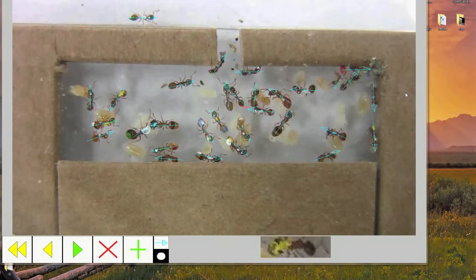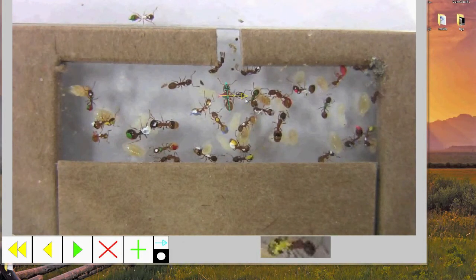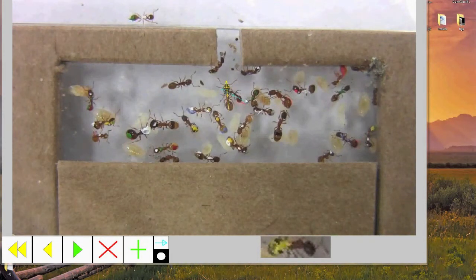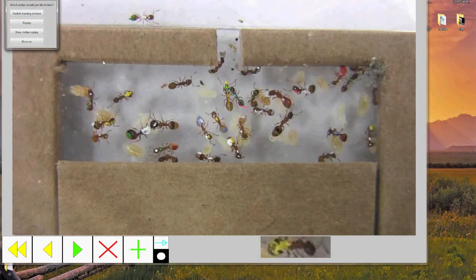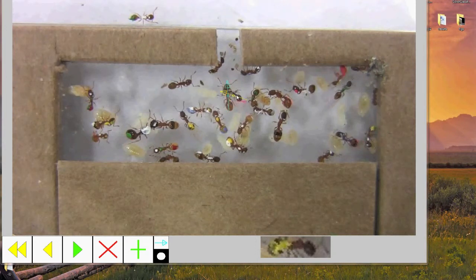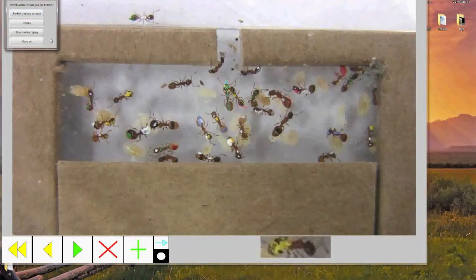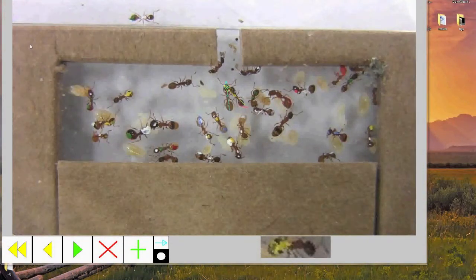Sometimes the automated tracking will stop and a pop-up window will appear asking you to validate the tracking results. When this happens, press OK and then watch the replay. Your job is to see whether the tracking arrows switch at all during the replay or whether they stay on the same ant the entire time. As you can see in this first replay, the tracking arrows do indeed switch, so when the next pop-up window appears, I will choose the option to switch the trackings. I then replay to confirm my results. As you can see now, the yellow arrow stays on the ant with the red tail the entire time. Now I can move on and continue the automated tracking.